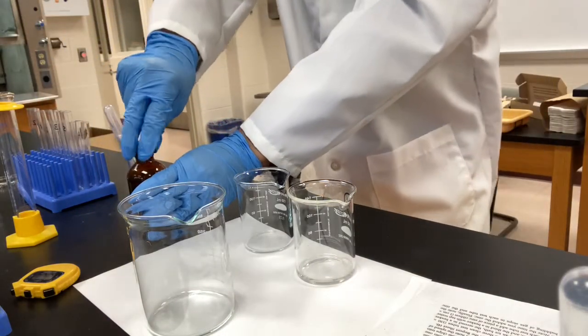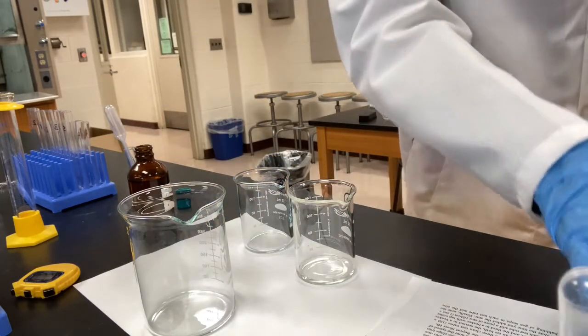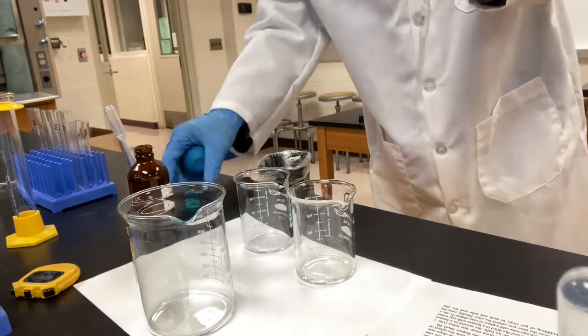To this beaker B, we need 5 mL of sodium bisulfite.